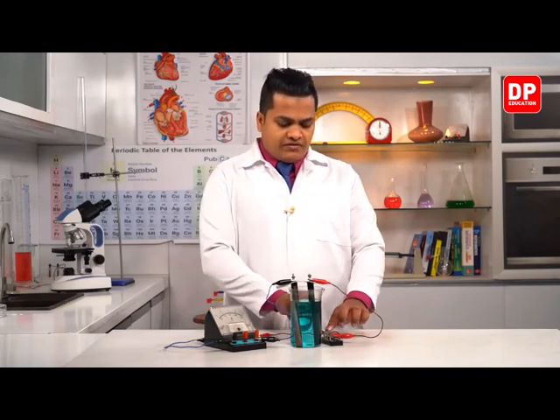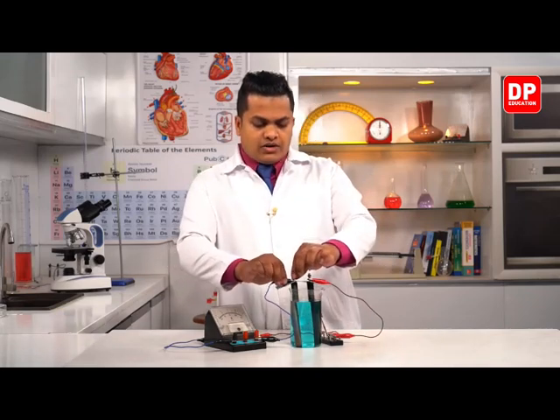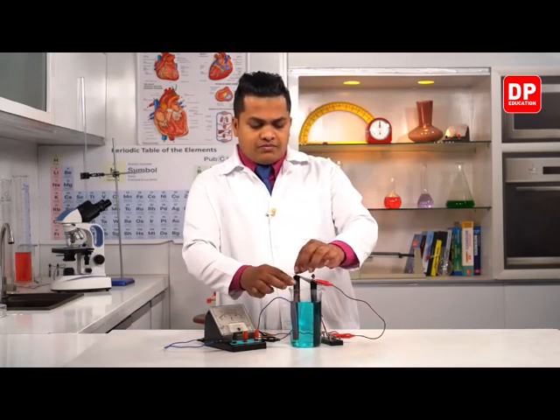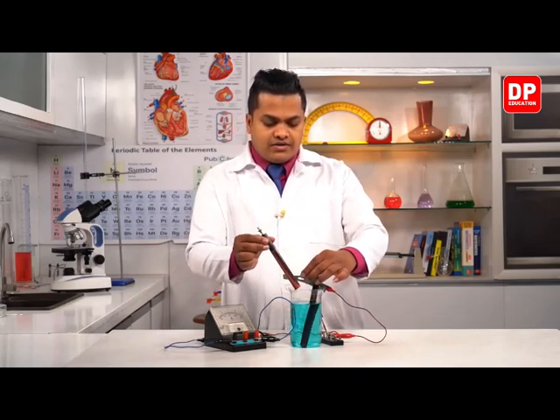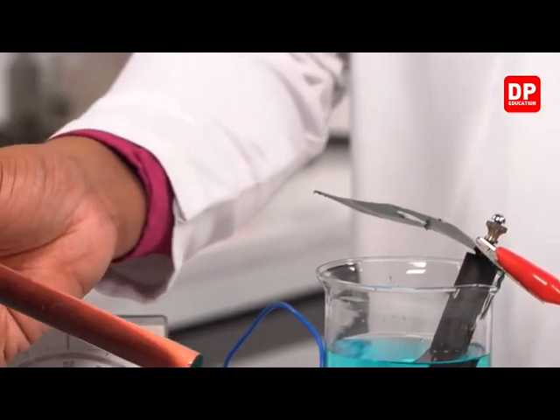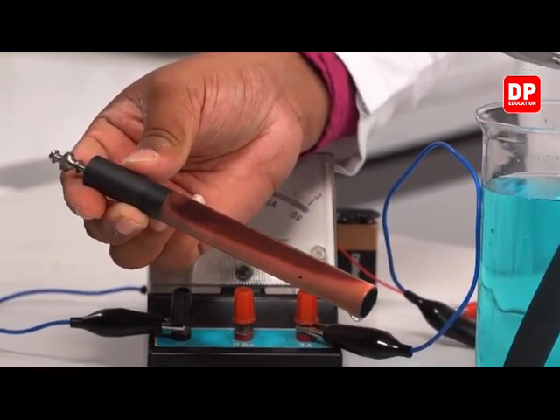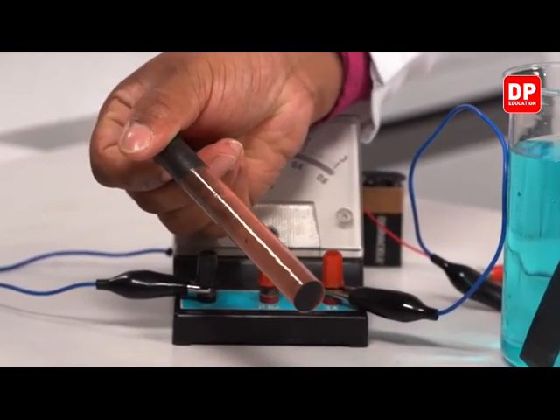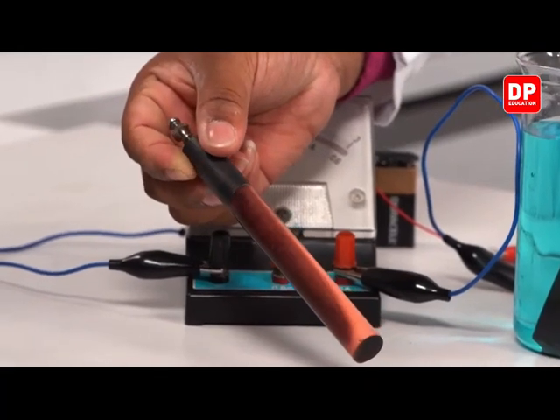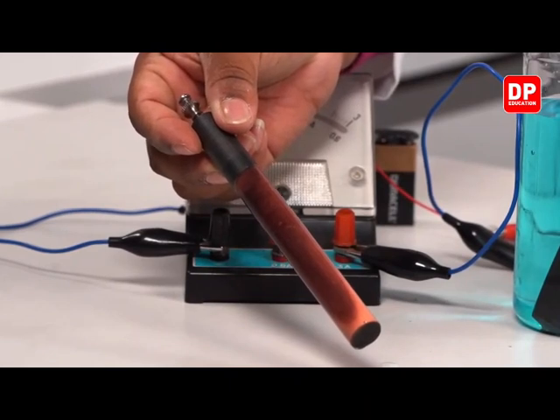So let's turn off the switch and now we'll take out the negative terminal and observe very clearly what has happened with it. As you can see here, there is a brownish color deposition around the carbon rod of the negative terminal. It's very clear to us.